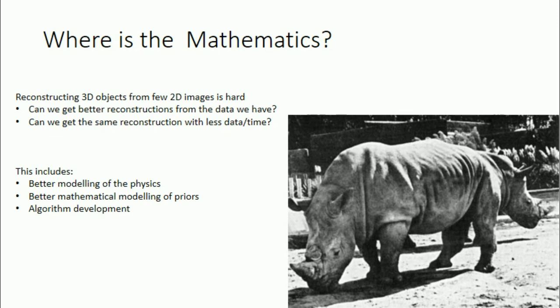The ground is very light, the rhino is very dark, and the interface between them is just a jump. One pixel is light and the next pixel is dark. The challenge is how to represent these verbal priors numerically so it can be fed into the reconstruction process.